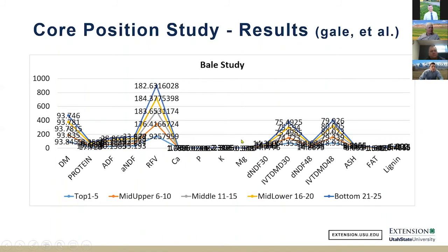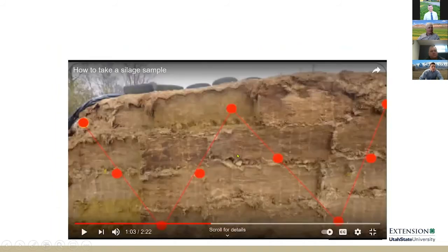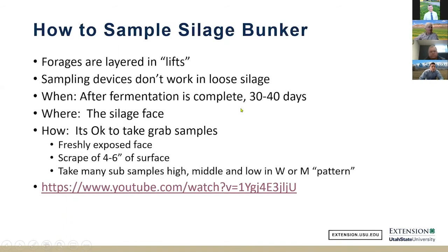I'm not sure if video will play, but I'm going to switch briefly and talk about sampling silages. Again, silages are wet, so it's a different method. You think about how the silages have been put in. You've got different lifts. Sampling devices don't work in silage, so taking grab samples is okay.